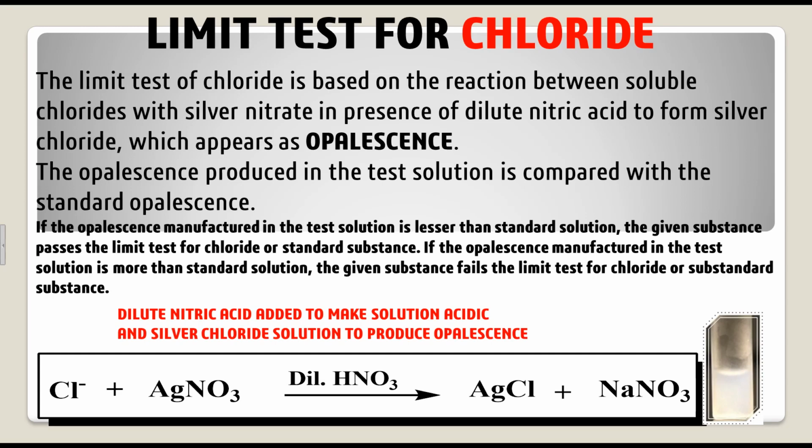How can we conclude the result? If the opalescence is lesser than the standard, it indicates the limit test passes. If the opalescence is more than the standard, it indicates the limit test fails.